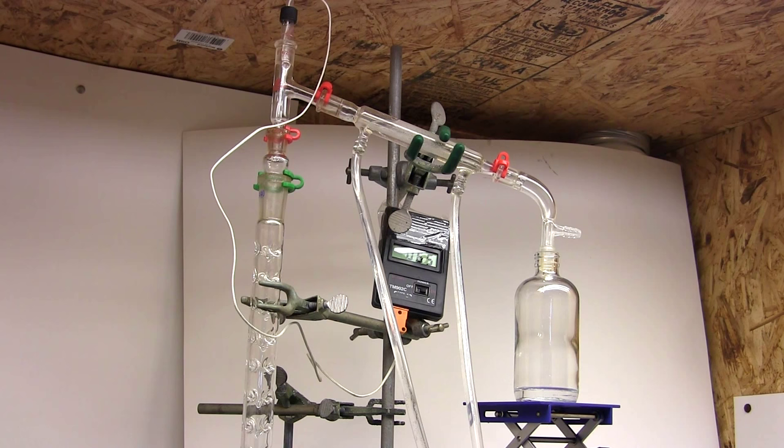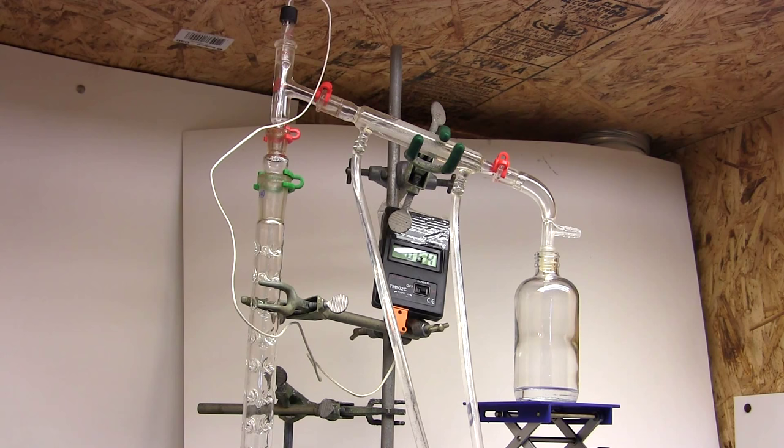But sometimes the properties of the component are such that it's very easy to overload the column and not get good separation. Now if I played with the heating I might find that spot in between no condensation and overloading where I get good separation. But because the best heating spot keeps moving as the composition of the source flask keeps changing, I'm not going to bother.